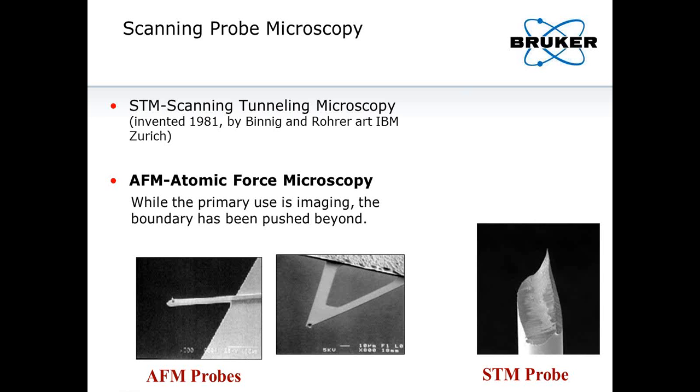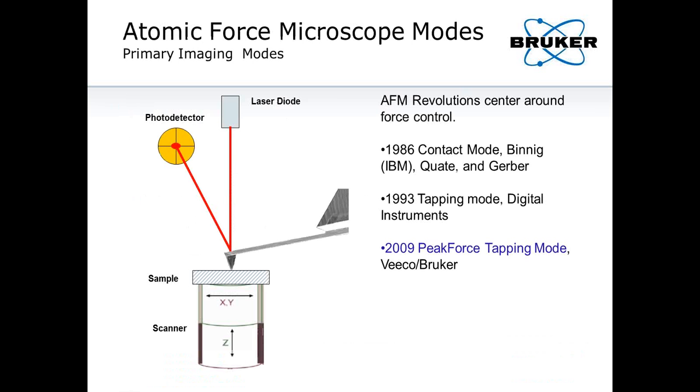In 1986, atomic force microscopy was invented. Now let me point out the major changes, or the revolution, of the AFM technique.